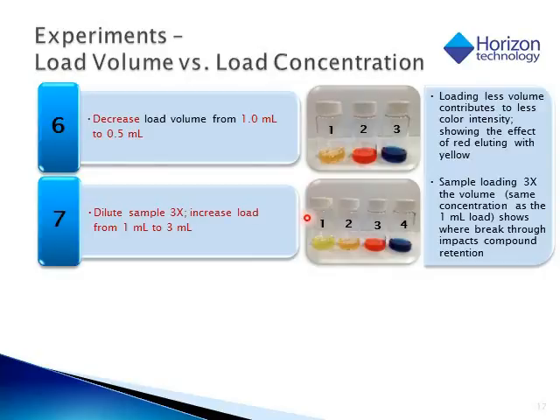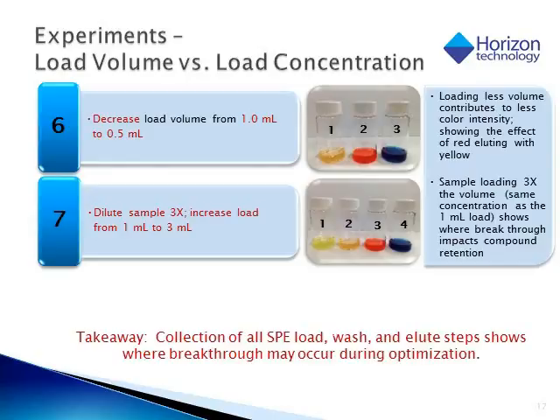And because the software allowed us to collect all of the steps, we were able to see that with the load step we are getting the yellow eluting through right away without being retained at all on the sorbent packing. So it's a really good idea, when you're testing load volume and load concentration, to allow for collection of all of the steps so that you can determine where breakthrough may occur.